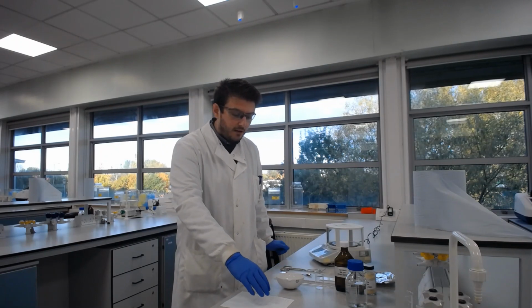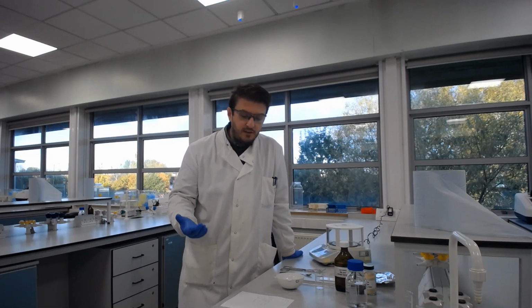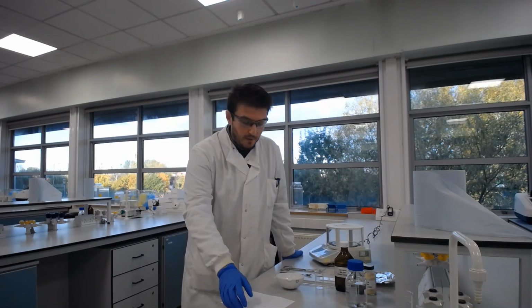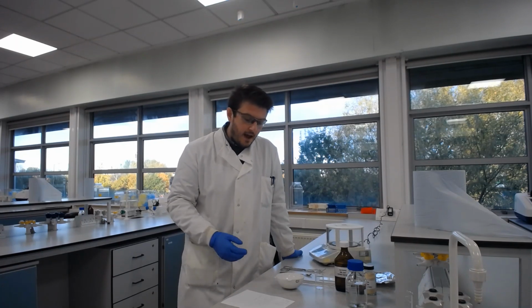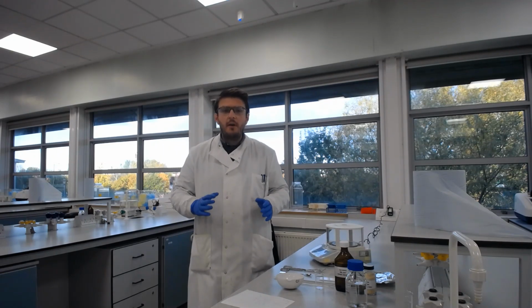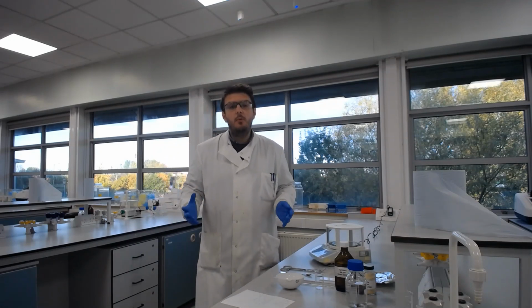So we want to get to 10 grams at the end, ultimately, and we know we need 70% glycerol, 14% gelatin and 16% water. That's very simple maths, hopefully, so we're going to need to have 7 grams of glycerol, 1.4 grams of gelatin and 1.6 grams of water at the end. We're going to need to use more water than that to begin with, but that's what we're going to end up with at the end. So in simple terms, we're going to heat all that up, mix it all together and pour it into molds.